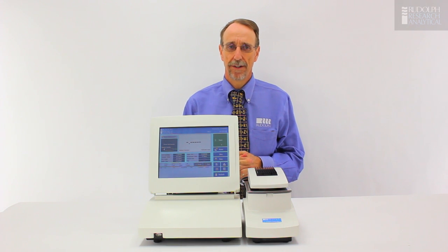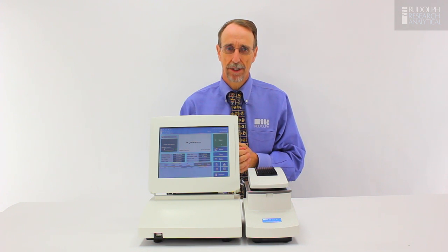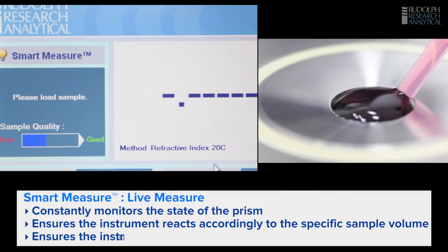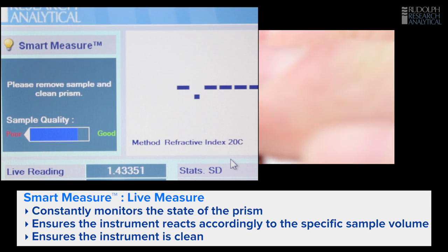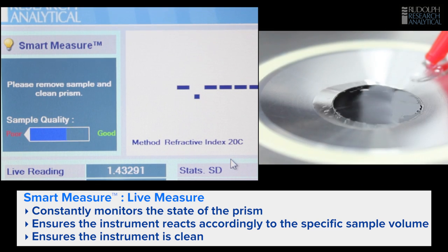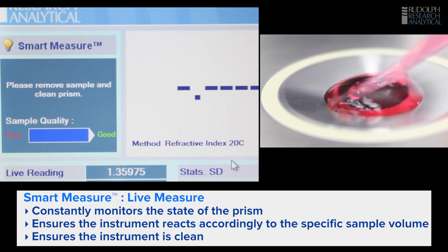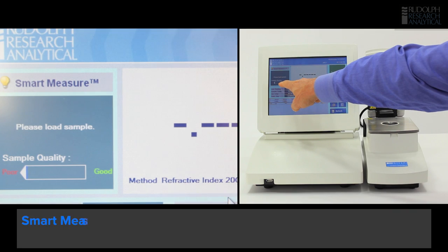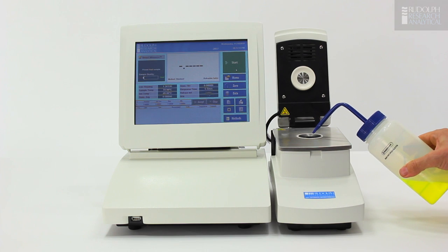Let's take a closer look at some of these features and how they can help you in the laboratory. The first feature I'm going to show is the SmartMeasure system. This instrument has what's known as LiveMeasure. This is a system that monitors the state of the prism and ensures the instrument reacts appropriately when the sample is placed on the prism or the instrument is clean. Before we start, we can look at the system over here — the sample quality indicator. This is down near zero, telling us that the instrument is clean before we start.